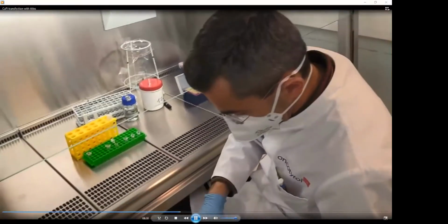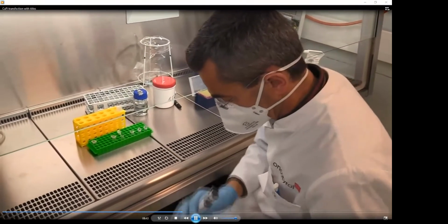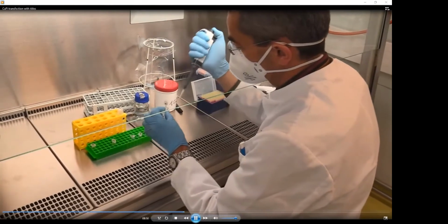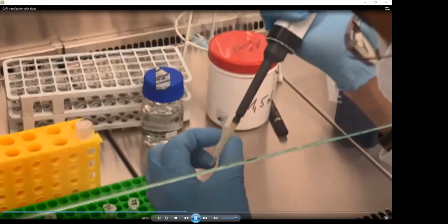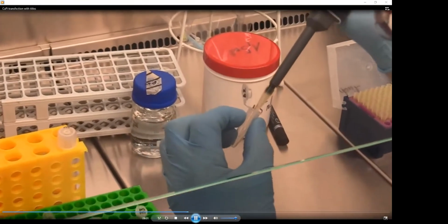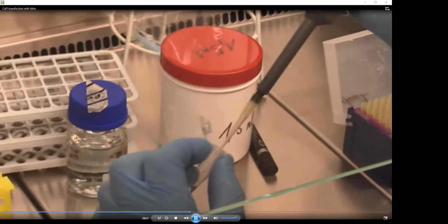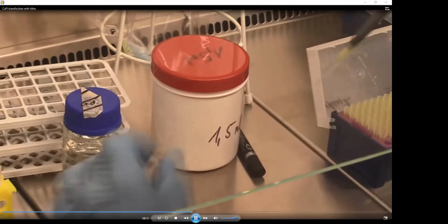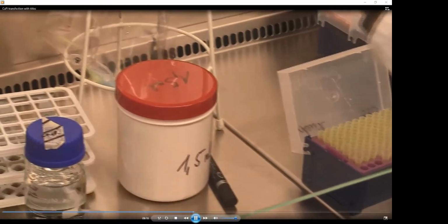Next part is the 140 microliters from this B, which we take out and use for the sample B2 and the second one for B3. So they contain already the reporter TOPflash. And in one case, we add this T7 DNA, and in the next one, we add beta-catenin. So this is from the master mix with our reporter, DNA mixed with the reporter TOPflash. And the next one is the last sample, which will be once again the reporter, and we will co-transfect beta-catenin.